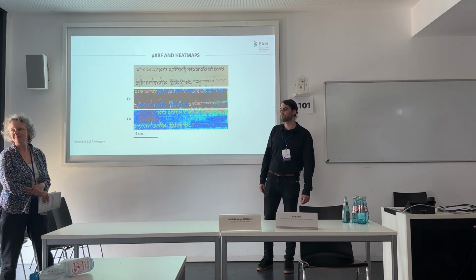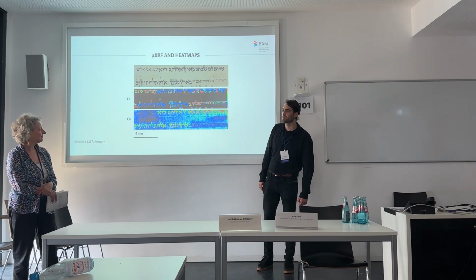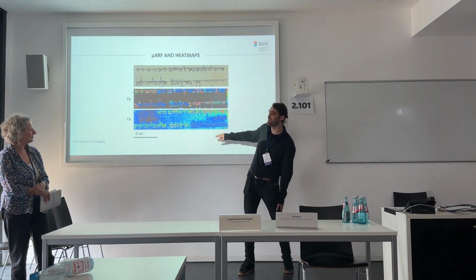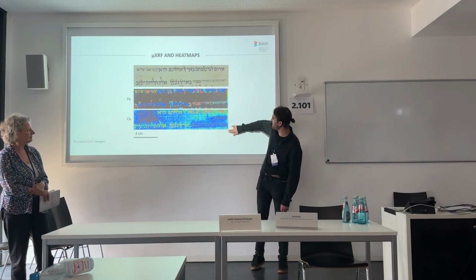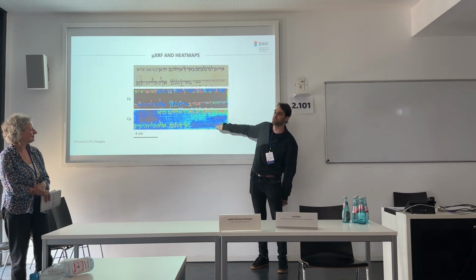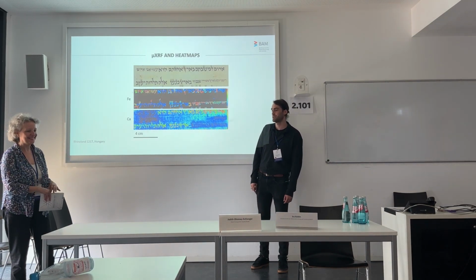In the negative here, are you seeing the remnants of the ink, or are you seeing the absence of calcium? Parchment? If you look at the scale, at the very bottom it's black. There's nothing, and we see that there is no calcium in those areas.